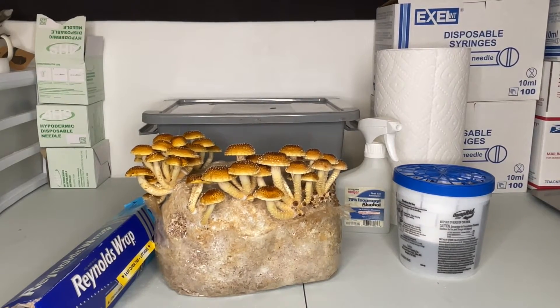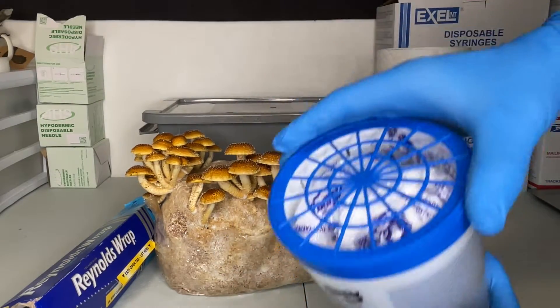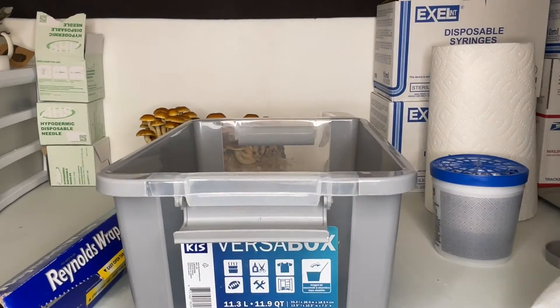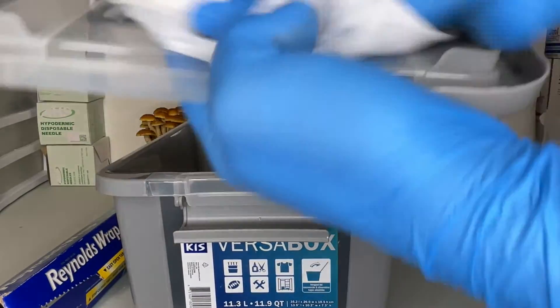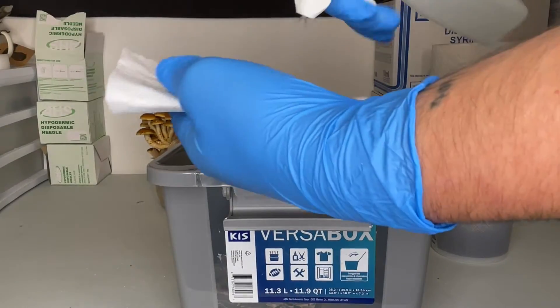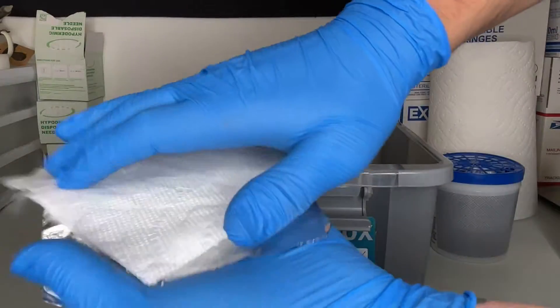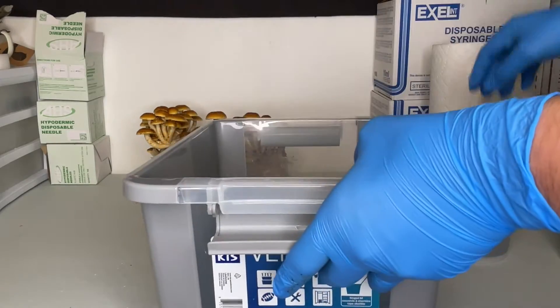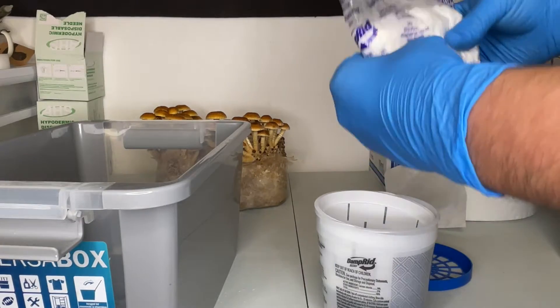When taking a spore print, it is important to keep it dry and clean, so I use DampRid crystals to absorb the excess moisture from the mushroom cap while it is printing. The container you're using to take the spore print should be wiped down with isopropyl alcohol. I like to use a clean piece of tinfoil to collect the spores. As the DampRid crystals absorb moisture, they will melt into the bottom compartment.